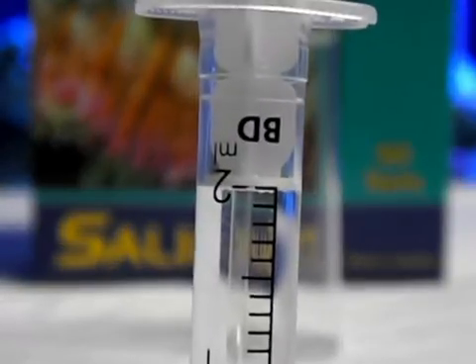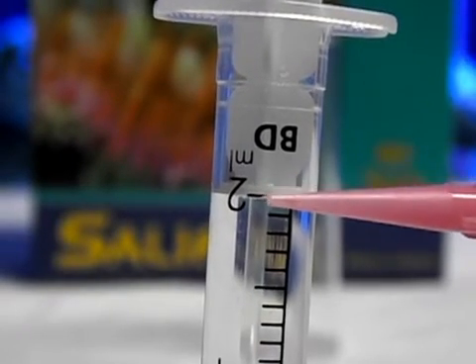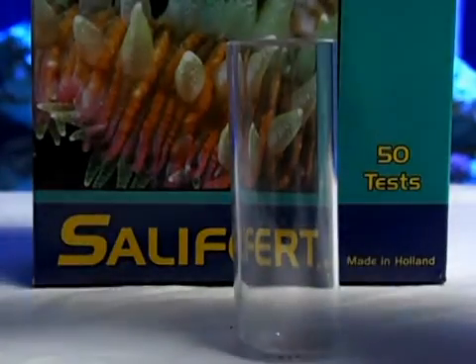It should look like this. The white part of the syringe lines right up with the two milliliter mark, and then you go ahead and add it to your test vial.